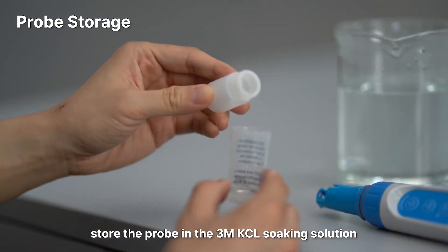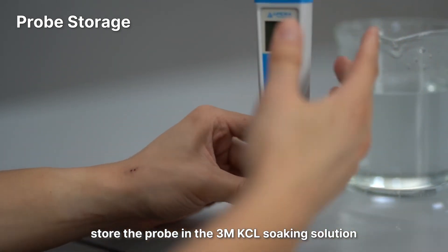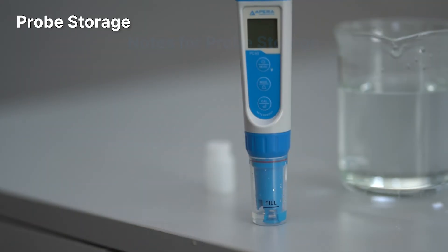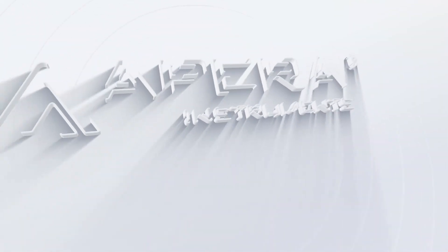For long-term storage, store the probe in the 3M KCl soaking solution. Never store the probe in pure water — such as tap, RO, distilled, or deionized water — as they could damage the pH sensor. If this happens, immediately soak the pH probe in 3M KCl soaking solution overnight to restore it, then recalibrate before using. Pure water is only for rinsing the probe, not for storage.